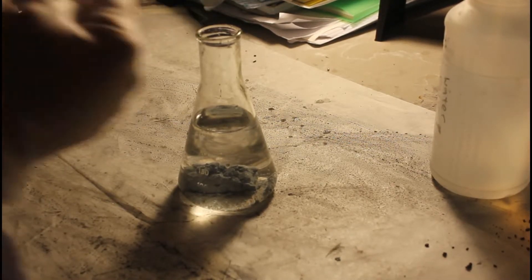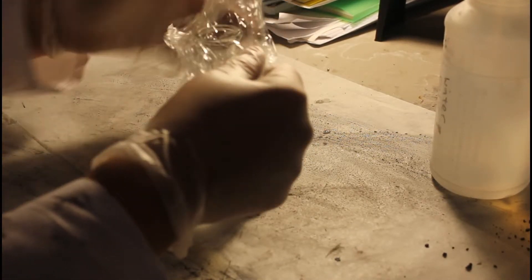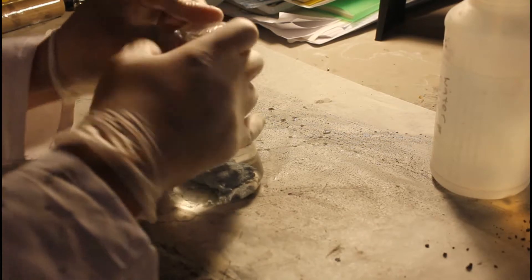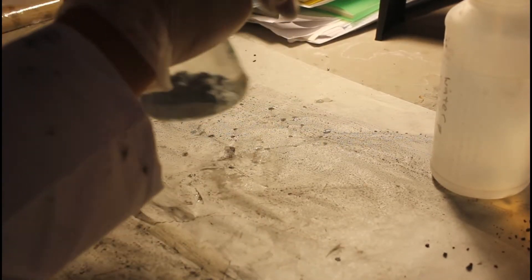The flask is then topped with plastic wrap and shaken vigorously to wash the zinc particles. This is done multiple times to try and dissolve off as much potassium hydroxide as possible. You will notice a white powder remains in suspension after the flask is shaken.